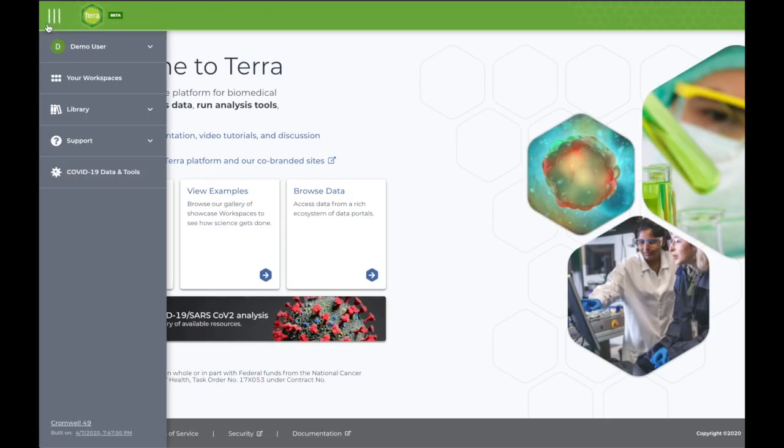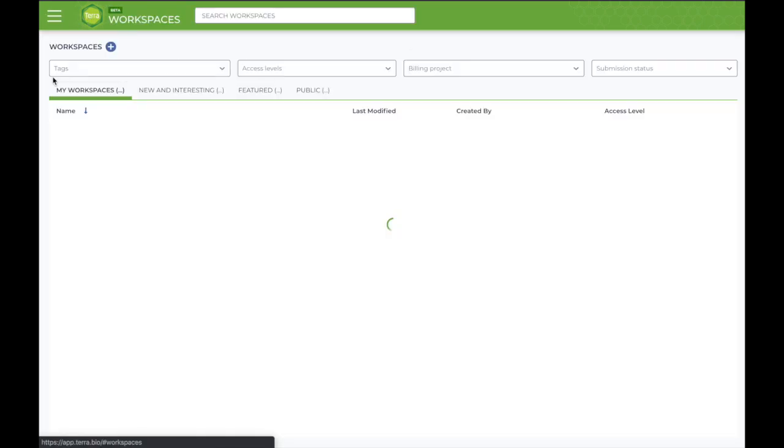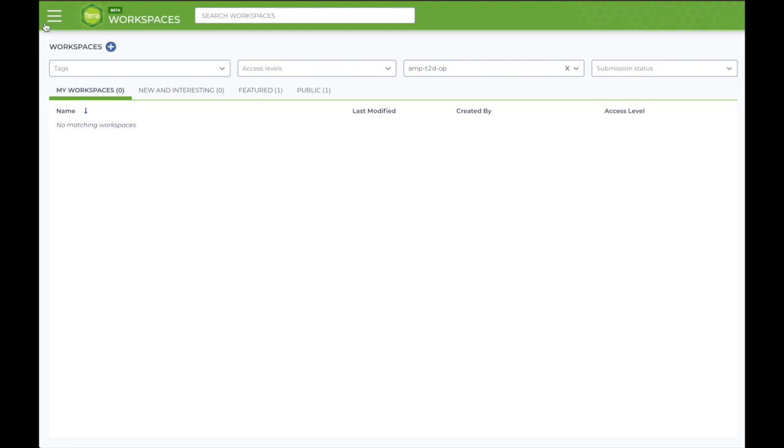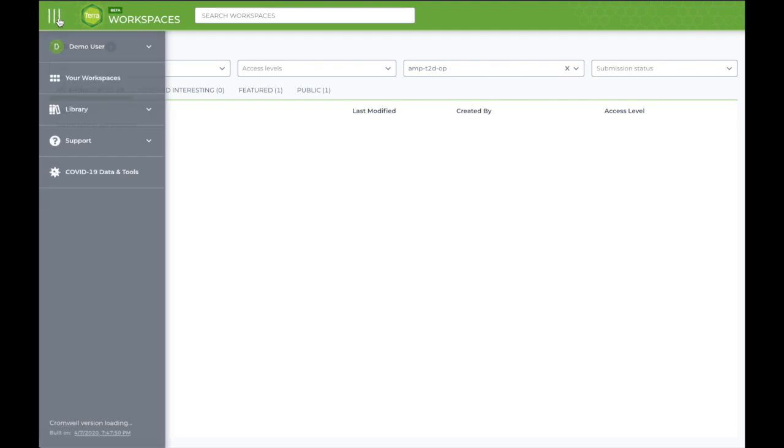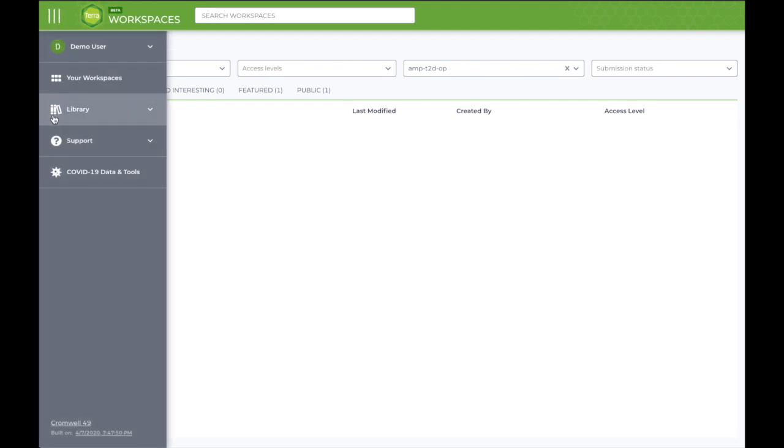When you visit your workspaces tab for the first time, the page should be empty. This is where you'll find your own workspaces when you begin creating them. But until then, the library tab will be your most useful tool, as it includes helpful links to get you started.